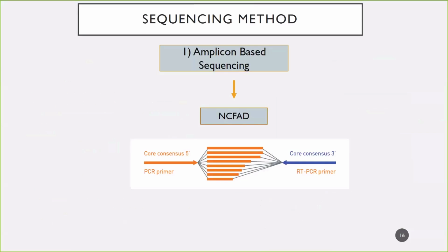Once we knew that we can detect influenza A virus in our air samples as well as the environmental swabs, we then wanted to see if we could derive viral RNA sequence from these samples. We used amplicon-based sequencing, and the sequencing was actually done at the National Center for Foreign Animal Disease. Next slide.